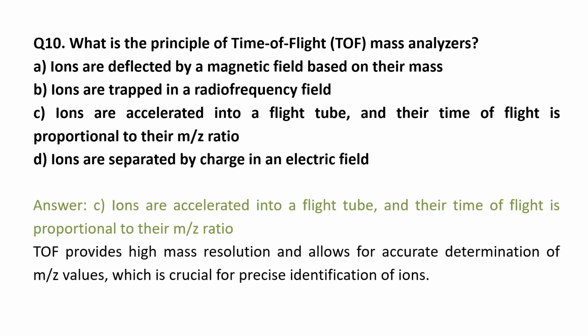So that's how it allows for accurate determination of mass to charge ratios.